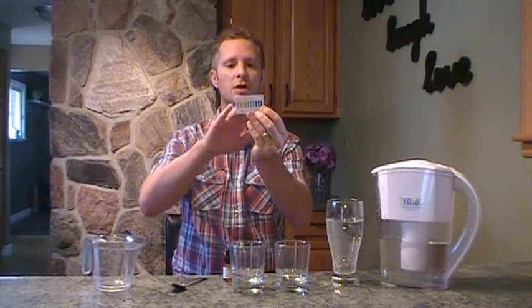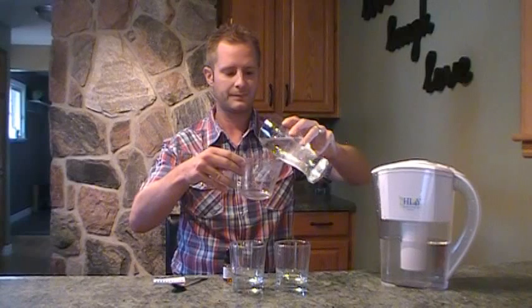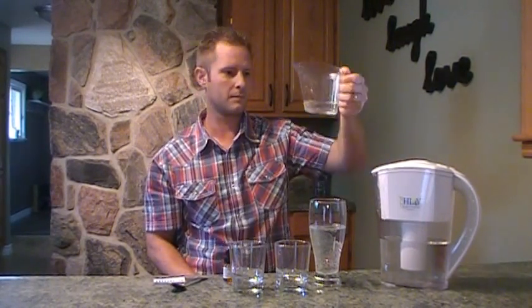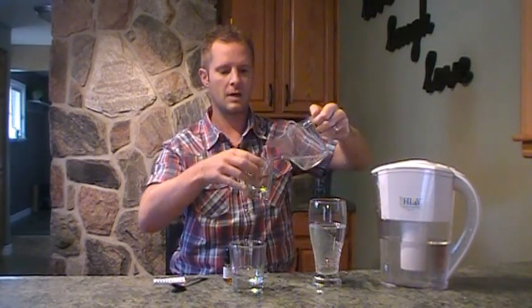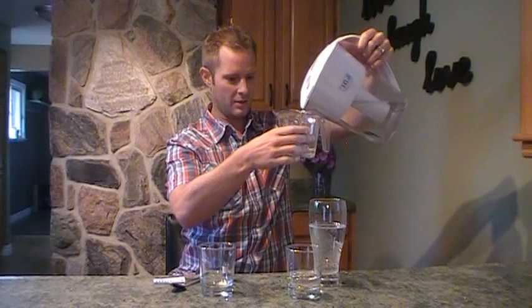So what I'm going to do first is measure out — on here I have the color list, and on the back it says two drops of reagent and 50 milliliters of the solution. So we're going to use 50 milliliters of water. Okay, so this is the tap water and I'm going to also fill up with alkaline water — nice, good, healthy alkaline water.